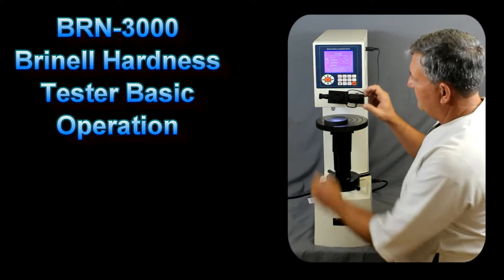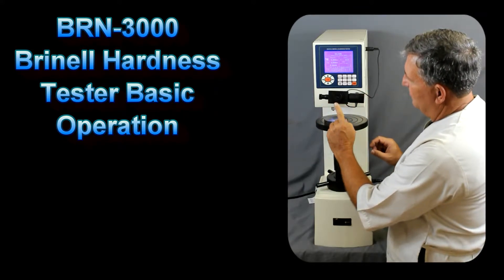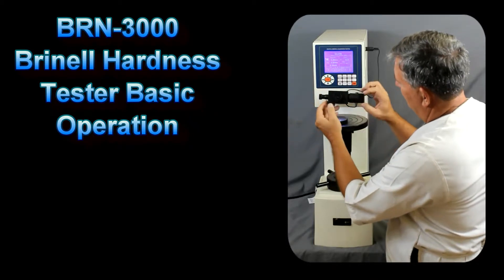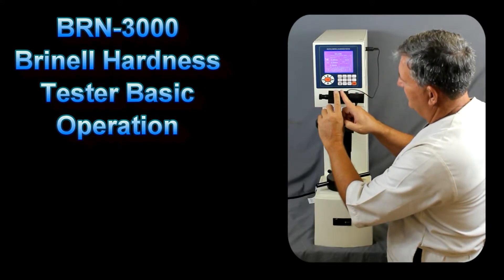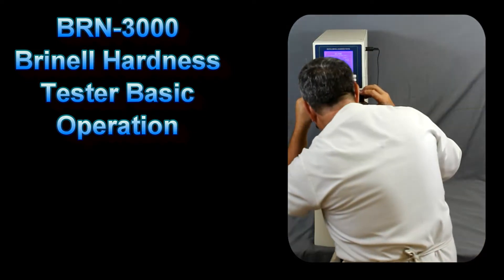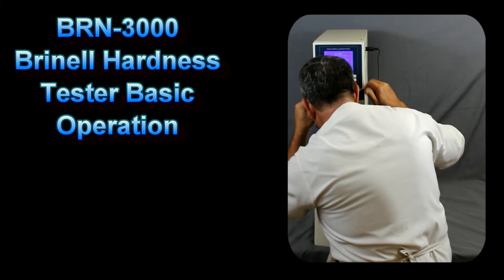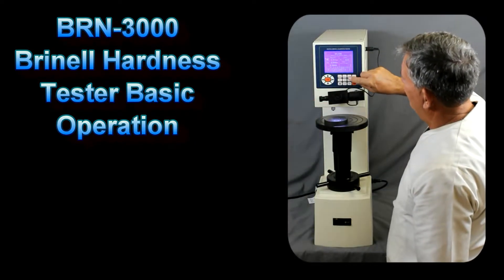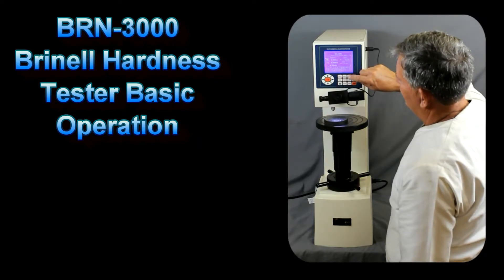At this point, we want to make sure that our filer system is calibrated to zero. The left knob will move the filers back and forth; the right knob will change the distance between them. We want to bring those filers so that they're just barely touching. Once they're touching, we press CLR-D — clearing the diagonal — and you see that sets it to zero.